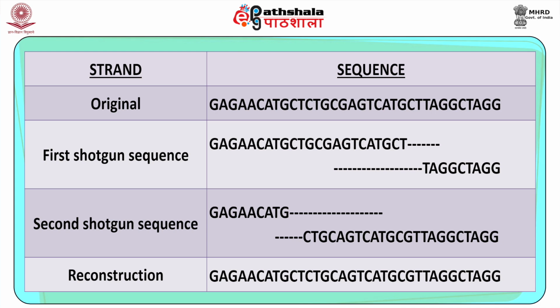To understand this further, you may look at the following two rounds of shotgun reads. Upon sequencing, neither of the sequences covers the full length of the original sequence, but all 4 reads can be aligned and overlapped into the original sequence using their overlapping ends.